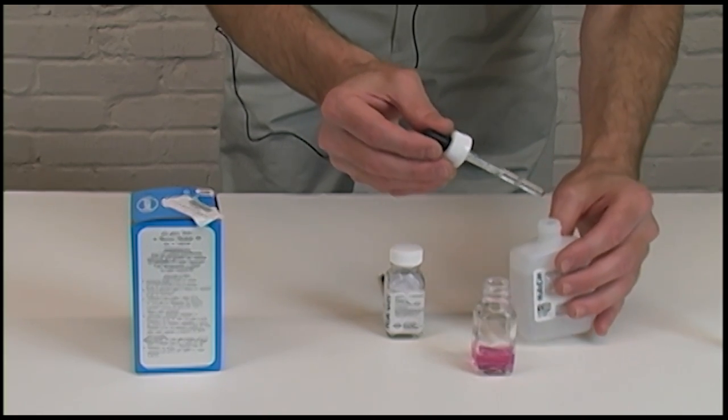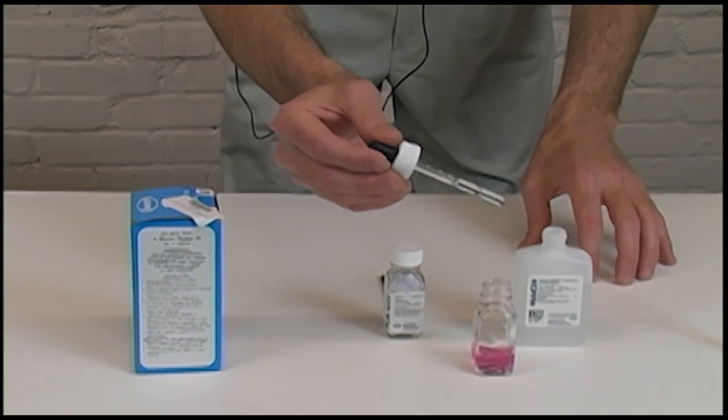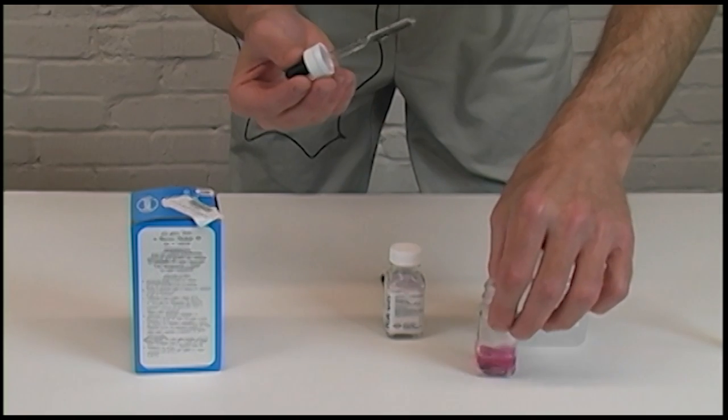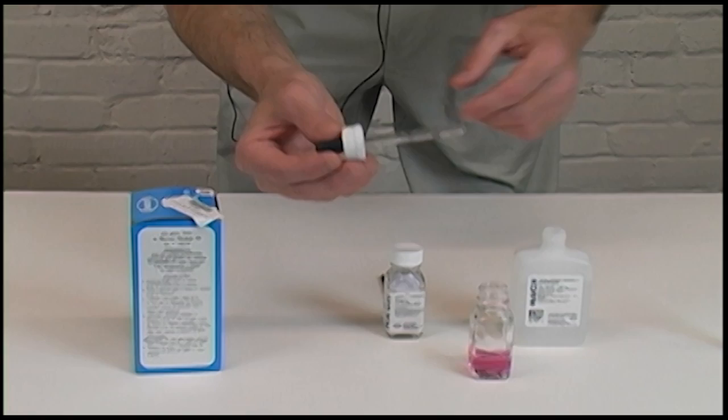For each drop, it'll tell you a grain of hardness. So two drops would be two grains of hardness, one drop would be one grain. Add one drop and stir it up, because you're looking for the color change to turn to blue.